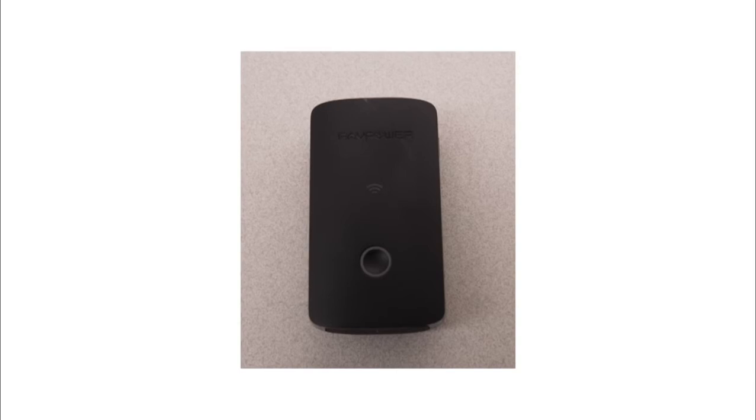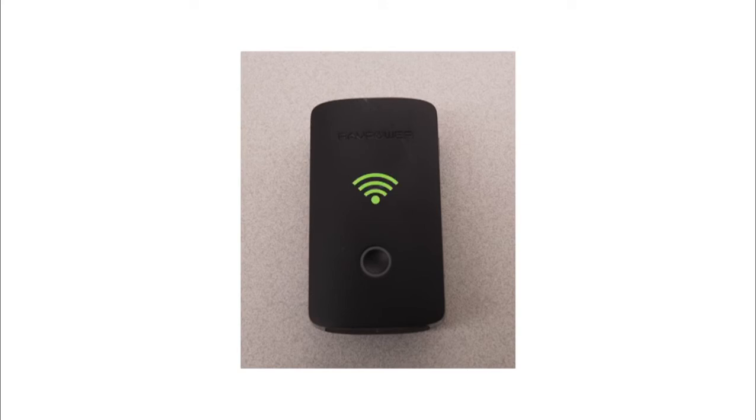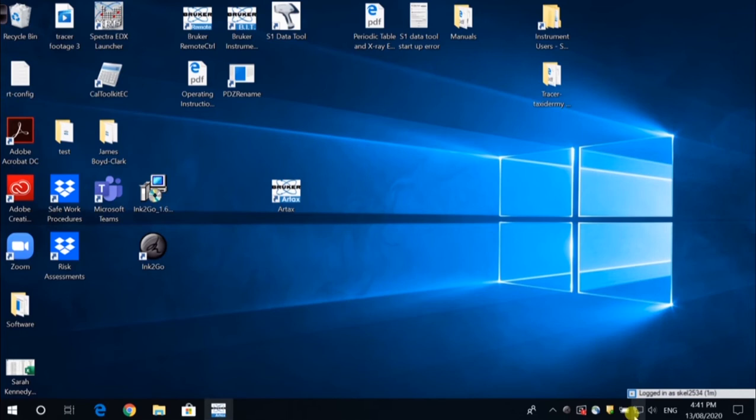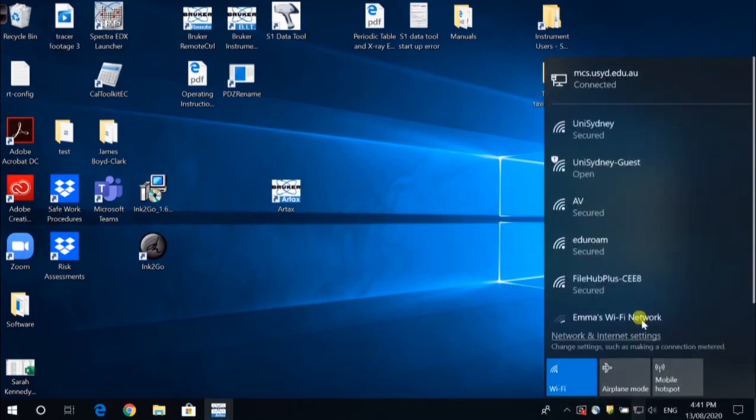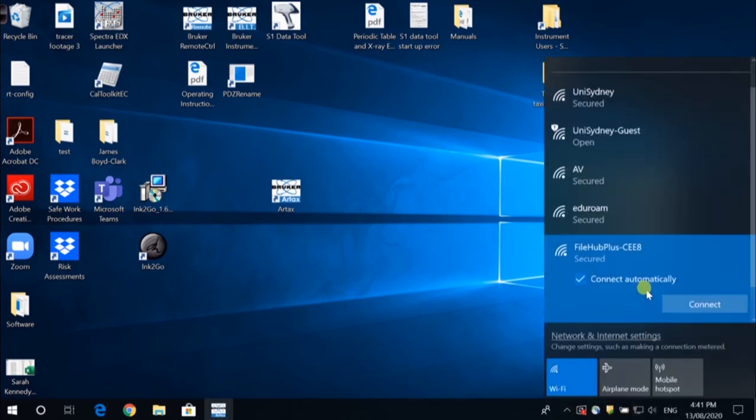To use the router, turn on the filehub router by holding the power button down until all of the blue lights have been lit and the Wi-Fi symbol flashes green. Once the Wi-Fi symbol has stopped flashing and is blue, the router is ready. On the computer, connect to the filehub router. It may take a few minutes for the computer Wi-Fi to recognise the router.